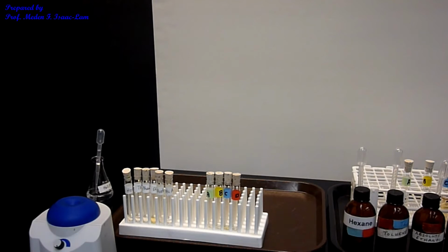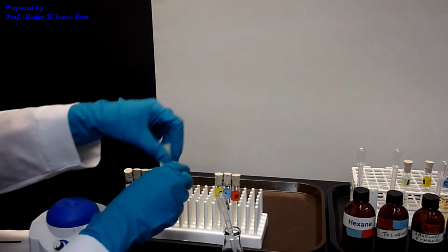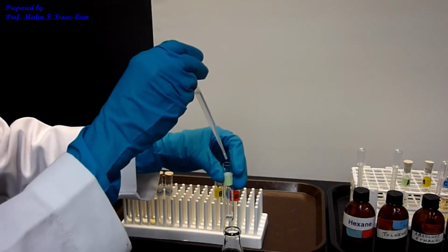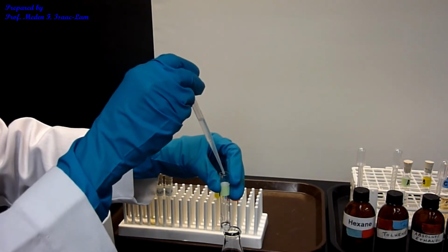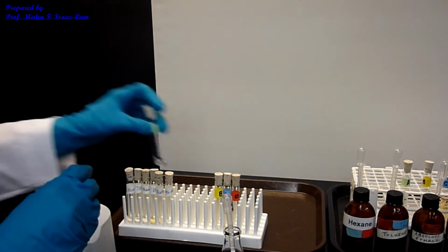Now I'm going to do the unknowns. The same idea. I'm going to add 10 drops of water. That's unknown A. Vortex a little bit.